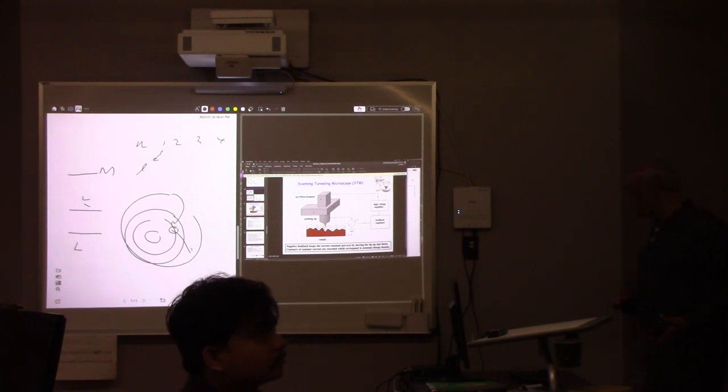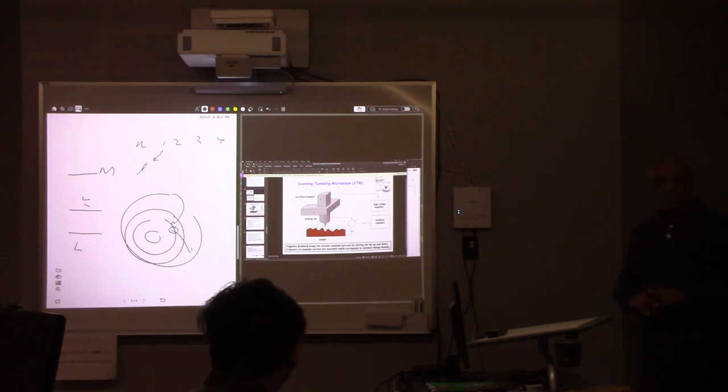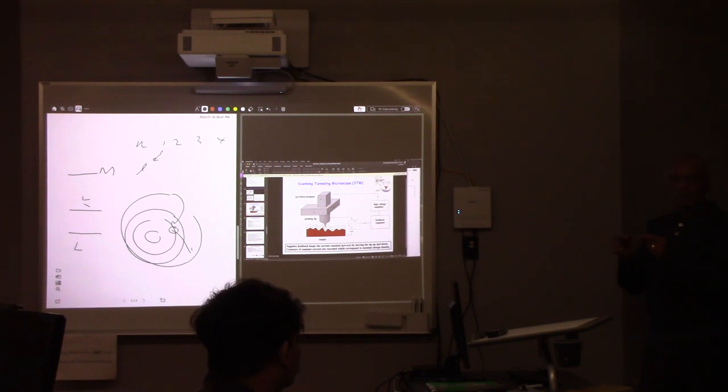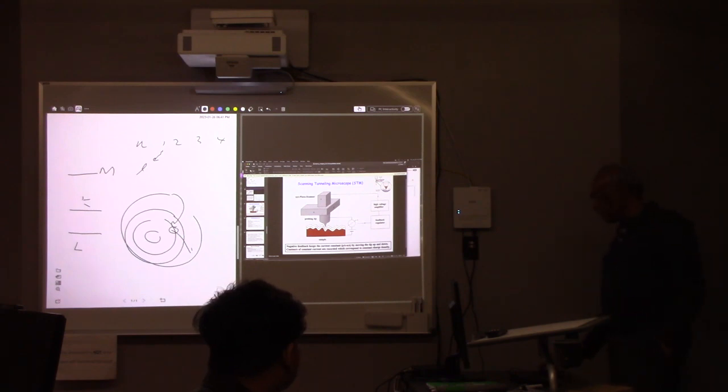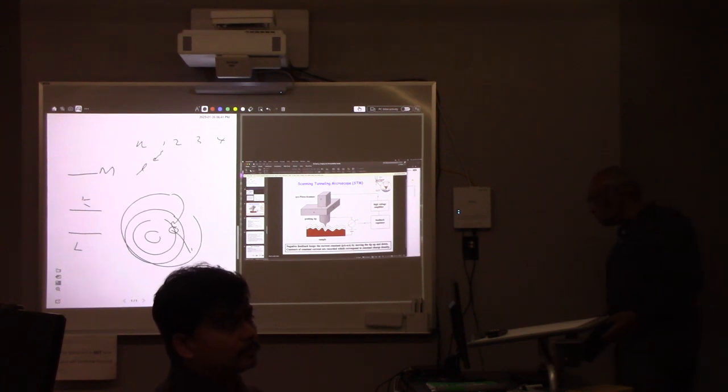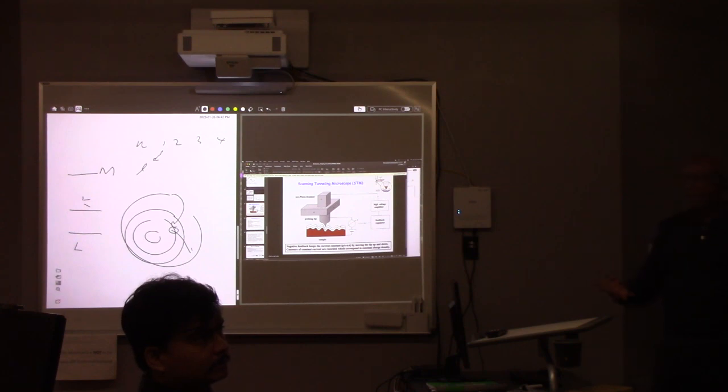Okay, so that's all I want to talk about, the simple imaging techniques. So let's quickly do something about the other two probing techniques. One is the scanning tunneling microscope. This is very neat. Have you seen that IBM people using STM? They could move atoms and make the letters IBM with atoms. So this is a really neat technique. You have a sample, then you have this STM probe, with something we call a piezo device, so it can move depending on the roughness.